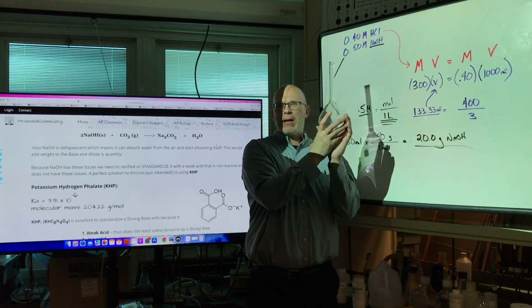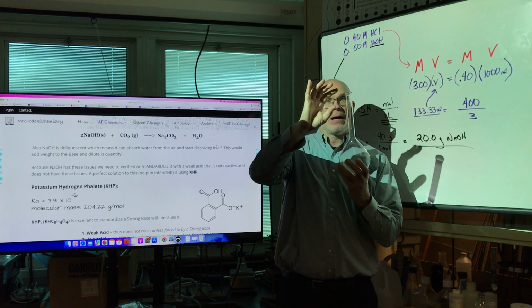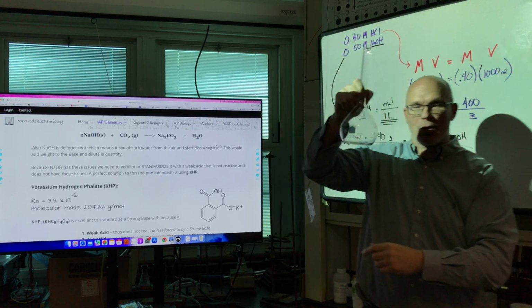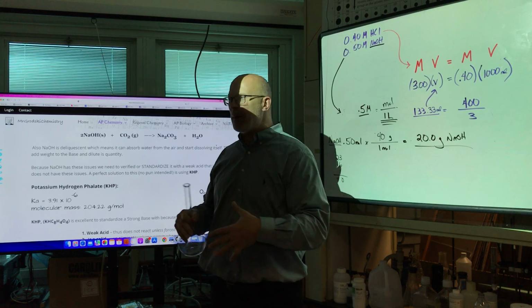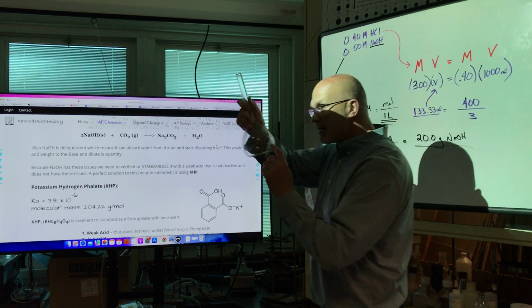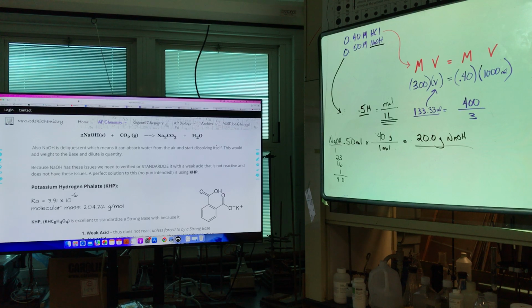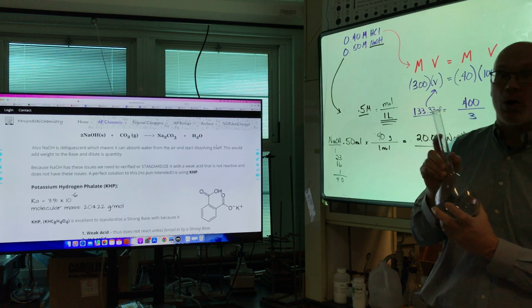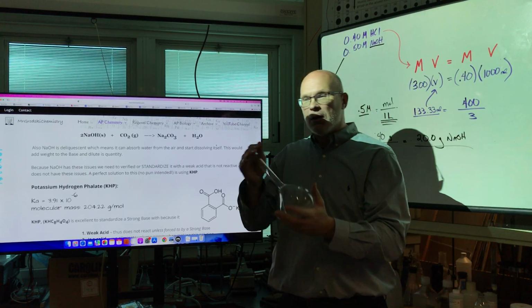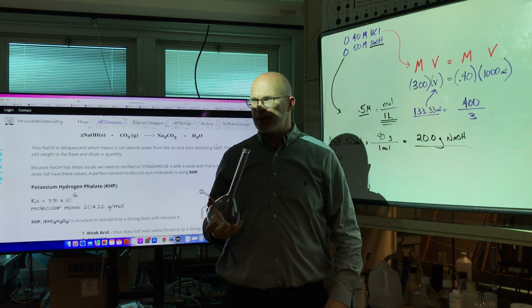Now, I'm going to make a 1 liter solution. So I'm going to carefully measure out sodium hydroxide. I put the solid carefully in here. I pre-dissolve it with distilled water because the space it takes up as a solid will be different than the space it takes up when it dissolves in the water. So I pre-dissolve it, and then I carefully, painstakingly add distilled water up to the little tiny gray mark, which makes this flask incredibly what? Expensive. Then I shake, shake, shake. And I do what Emma likes to do, the swirl, and we dissolve it, and we have the solution.